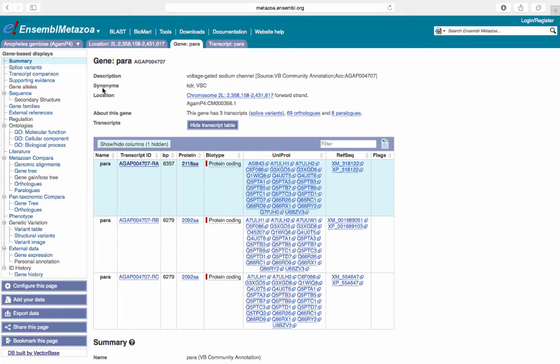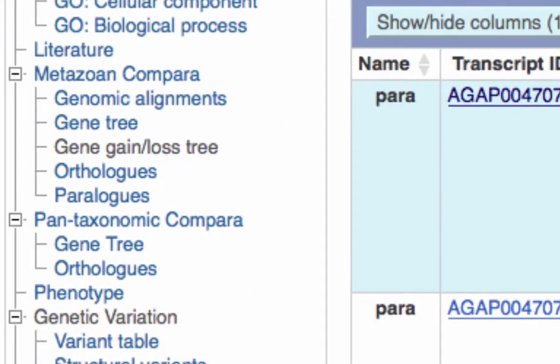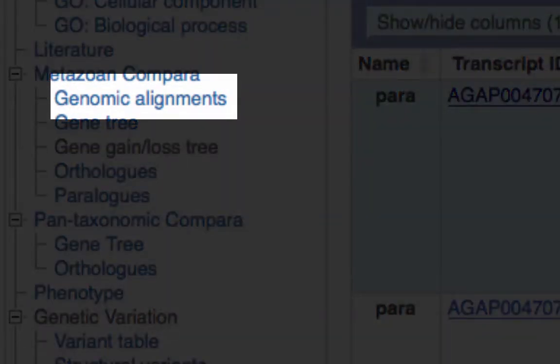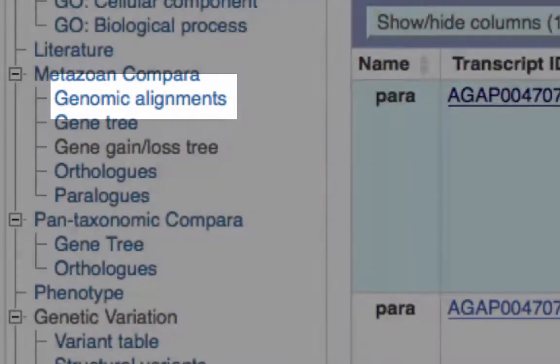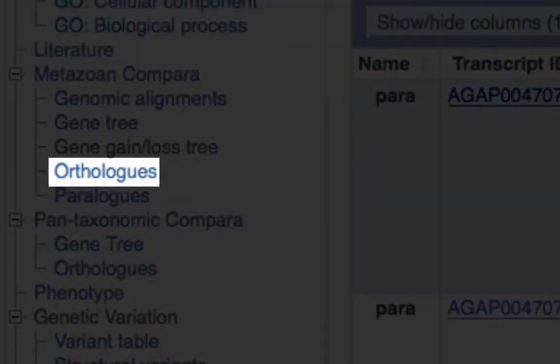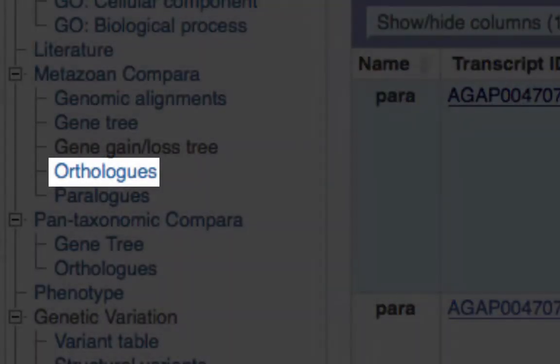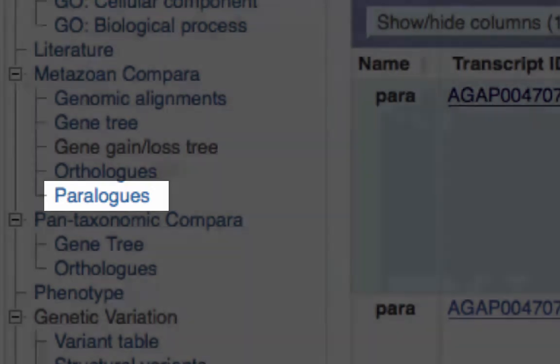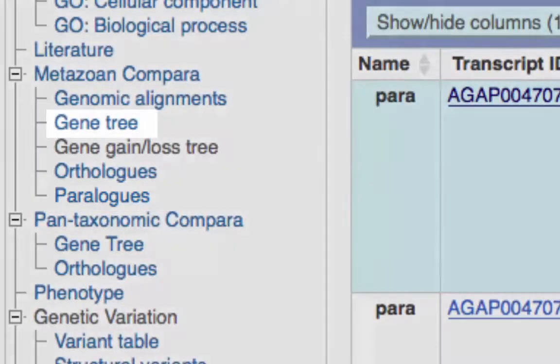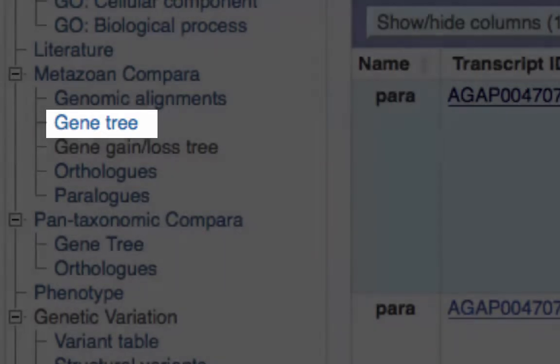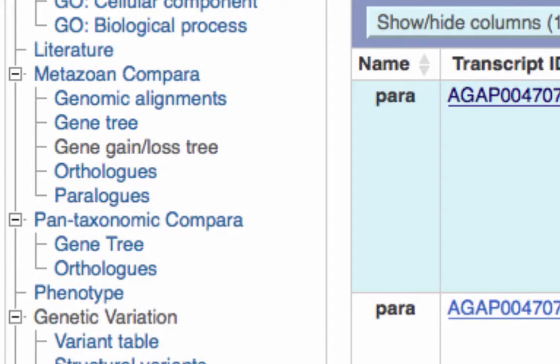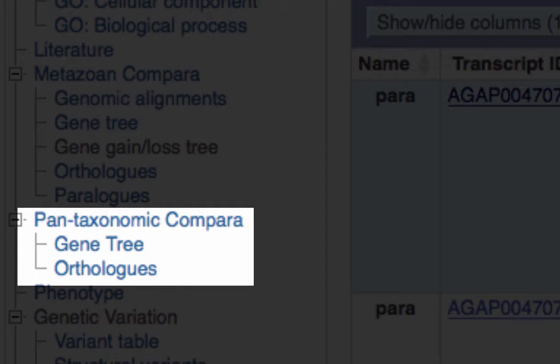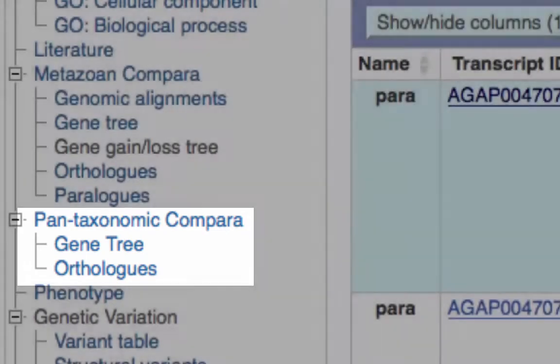From the Gene tab, Compara features can be found in the menu on the left-hand side. Options within Metazoan Compara allow you to view conservation and alignment, orthologs, paralogs, and gene trees with other metazoan organisms represented in Ensembl genomes. Furthermore, Pan-Taxonomic Compara allows you to view conservation and alignment between orthologs from species represented in Ensembl, or the other branches of Ensembl genomes.